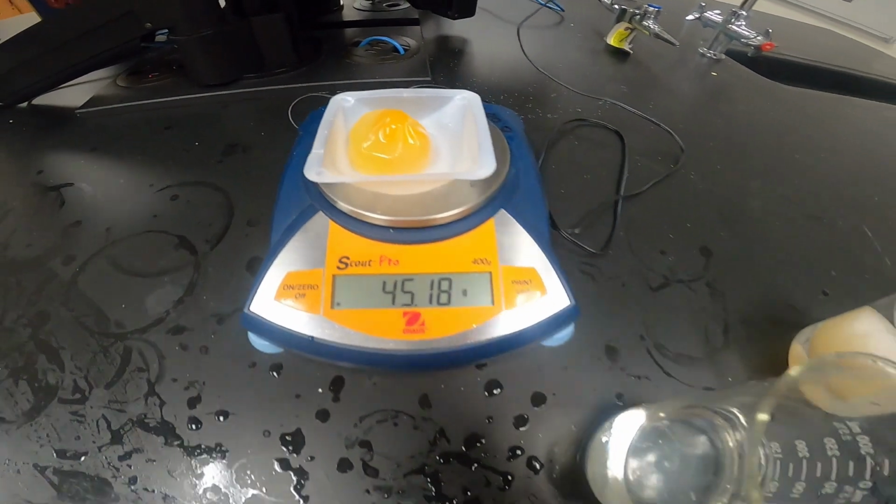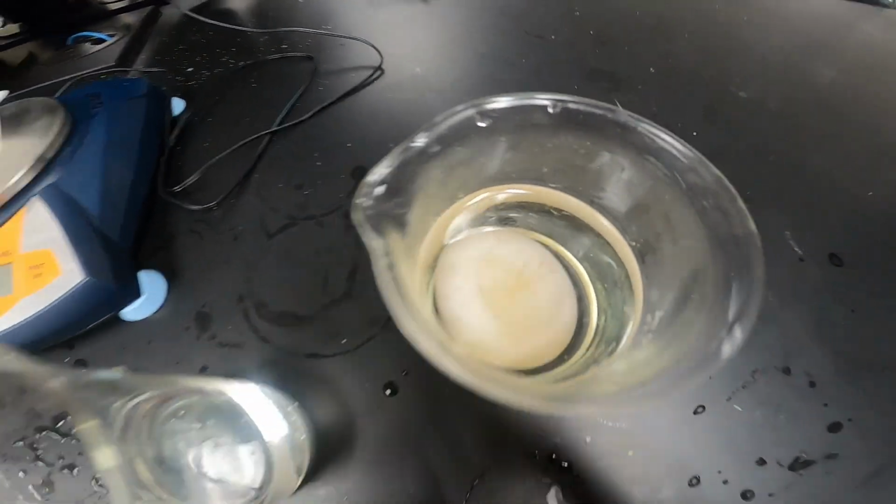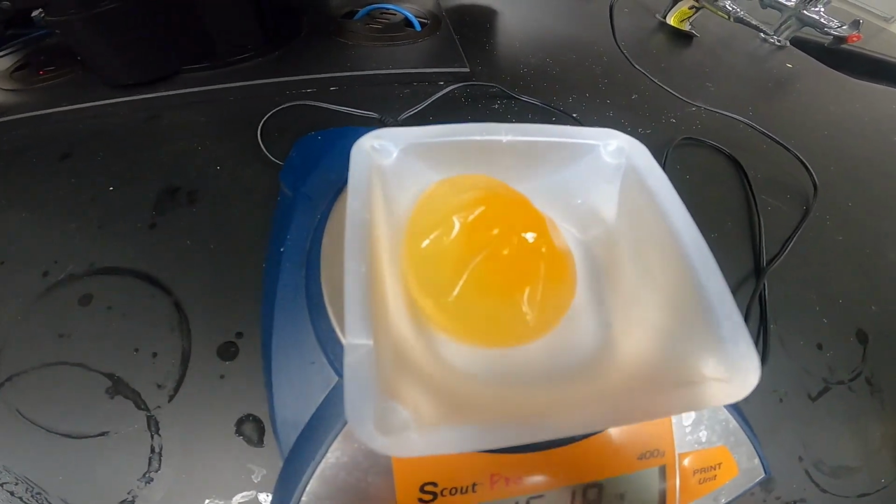So hopefully you've gotten your data for your egg. Again, our water egg, much inflated. Corn syrup egg, very much deflated.